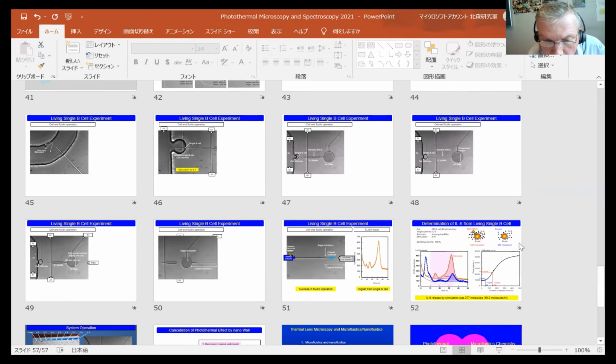Because I see no question at the moment, I can immediately ask my first question. I was wondering, in the case of the very small channels that you showed us, typically you have volumes in the range of femto to picoliters. So what are the pressures needed to have reasonable times of transfer? You know, viscosity is a problem, right? And as many people ask the same question.